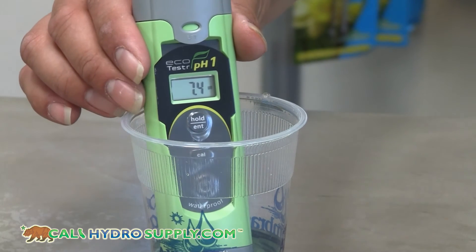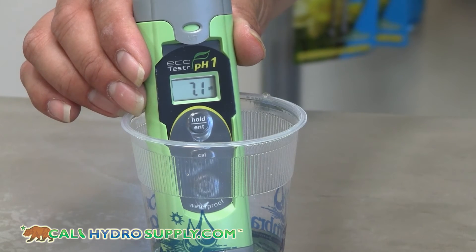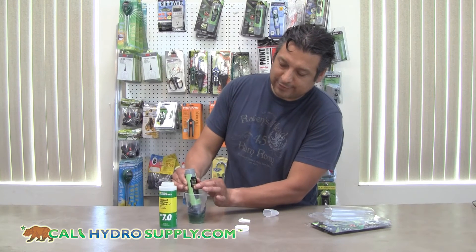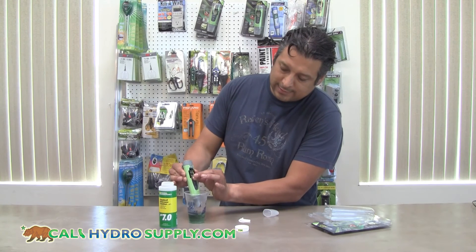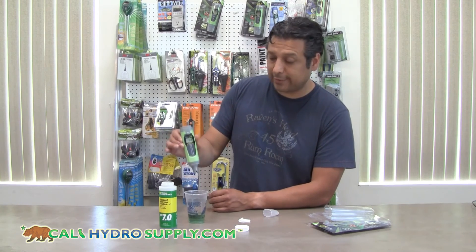In this case it reaches 7.0 immediately because out of the package they do come precalibrated. Once it hits 7.0 you'll hold down the calibration button and you'll let it go. For the most part you're done.